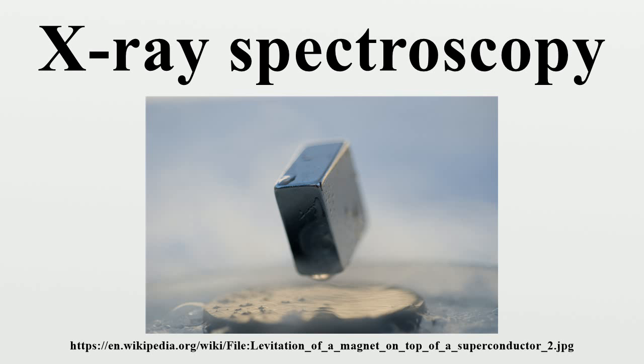The photon-in photon-out process may be thought of as a scattering event, when the X-ray energy corresponds to the binding energy of a core-level electron. This scattering process is resonantly enhanced by many orders of magnitude. This type of X-ray emission spectroscopy is often referred to as resonant inelastic X-ray scattering.